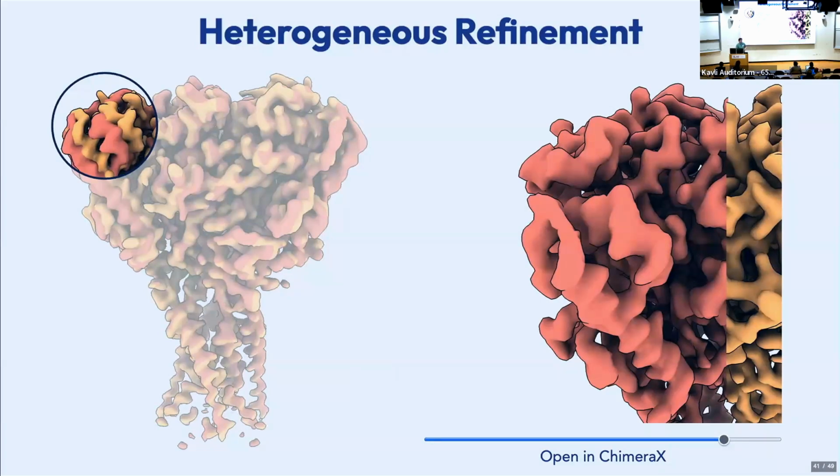If your project is, hey, is FMRF binding in our sample? And you get a map where it's bound and a map where it's not, you're like, yeah, and then you're done, right? And that's just my philosophy, right? There are certainly people in the field of cryo-EM, and I'm not saying they're wrong, who say it is a disservice to the community if you don't push your data set as hard as you can push it.